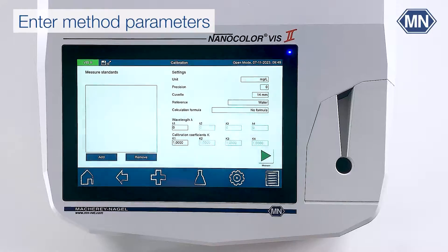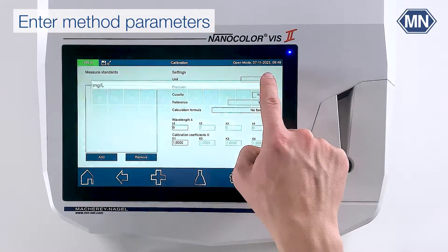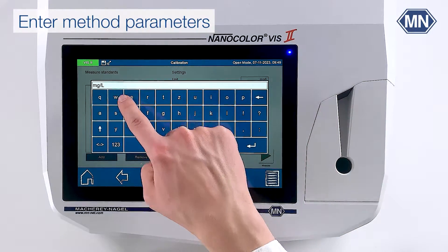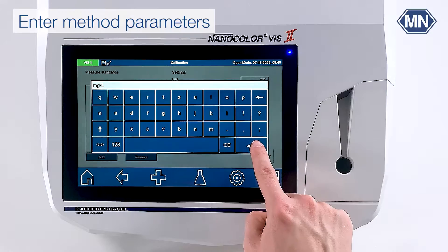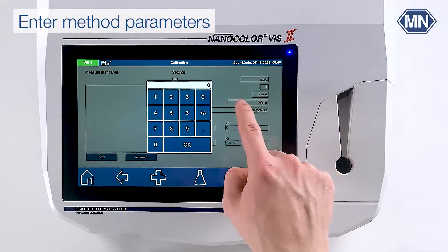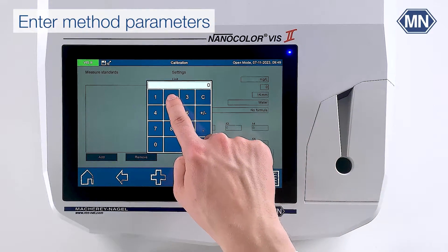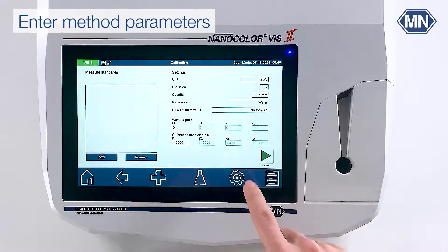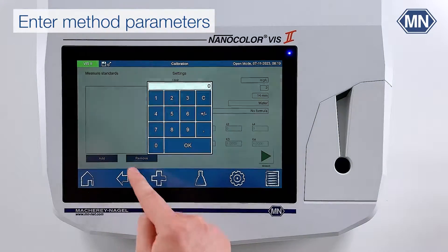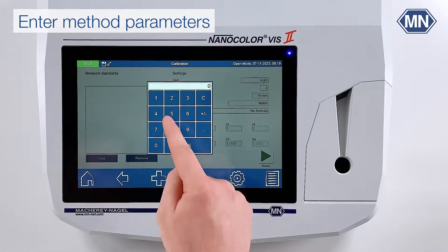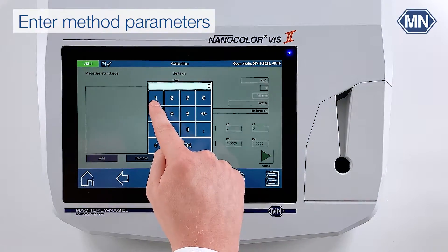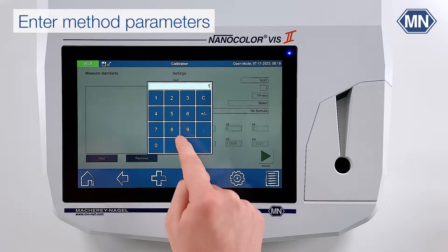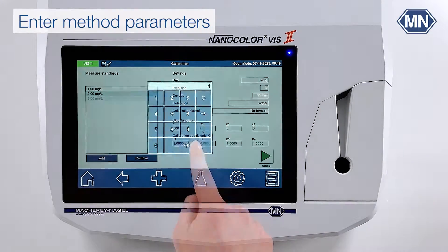As first step, choose the unit in which your user-defined method will be displayed. Select the number of decimals in the field position and insert the concentration for each prepared standard solution in the table on the left side.